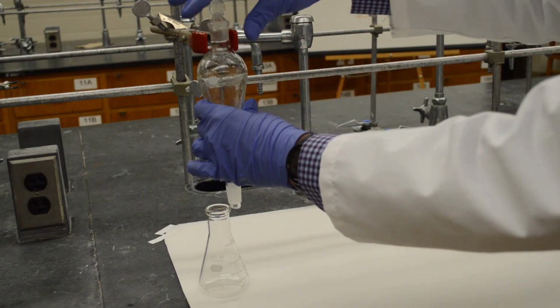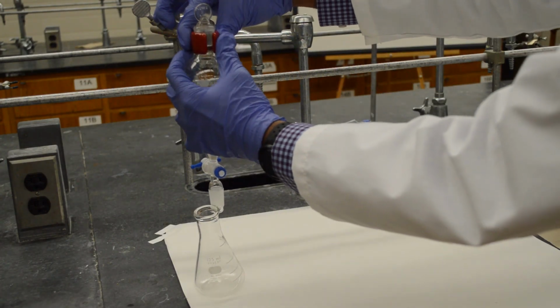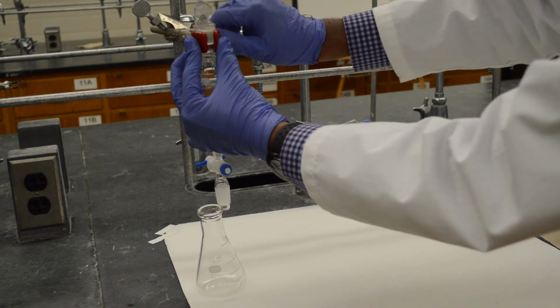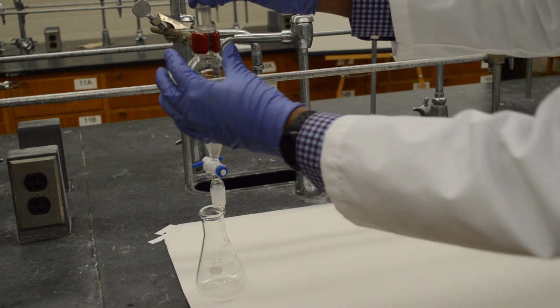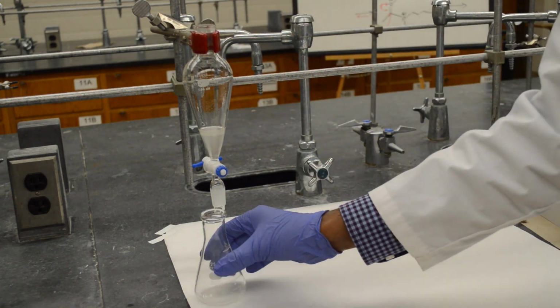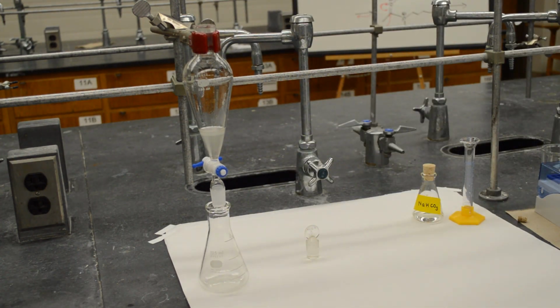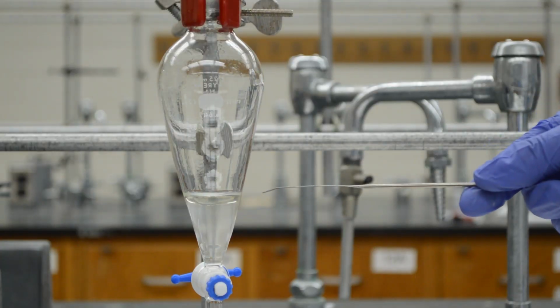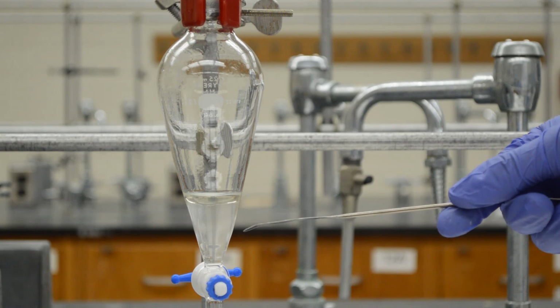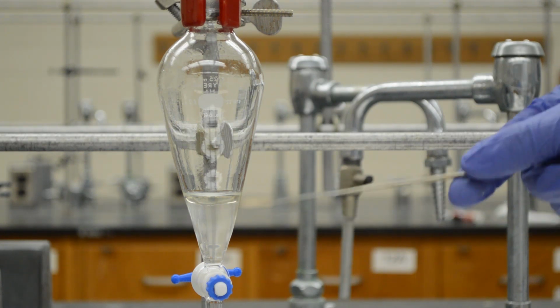Let's clamp the separating flask and let the two phases separate. The top one is the organic phase and the bottom one is the aqueous. Let's drain the aqueous.